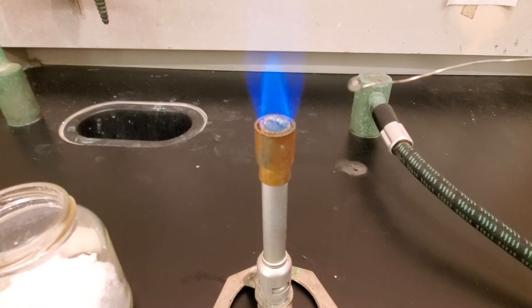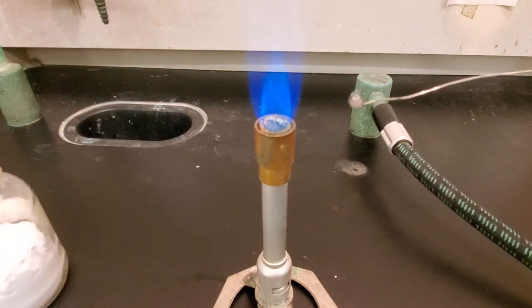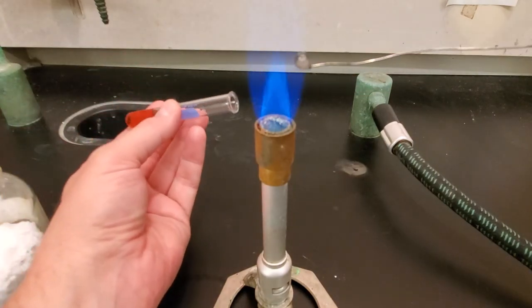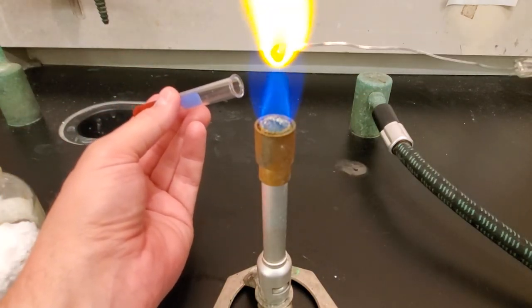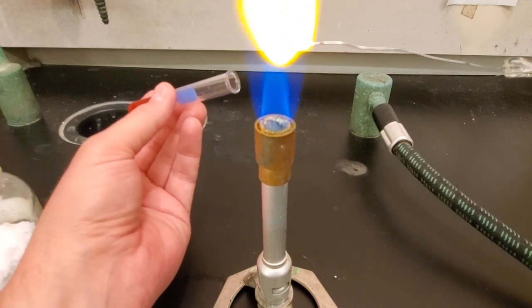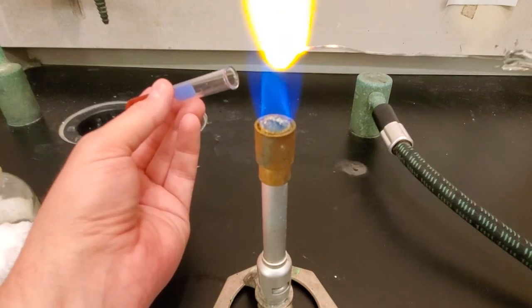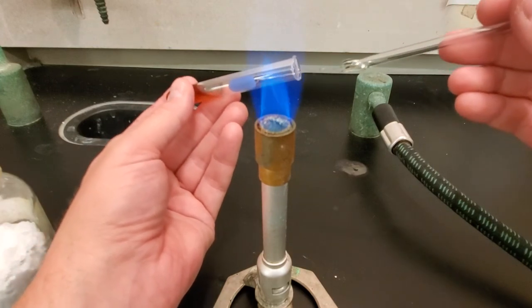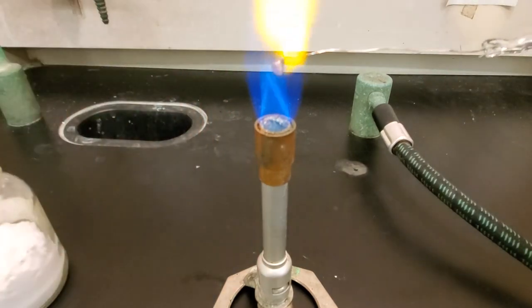What we need to do is take this bead and dip it into our solution, then put it back in the flame. I'm going to heat this up again to get it red hot, then go right into our cobalt solution, and then right back in the flame.